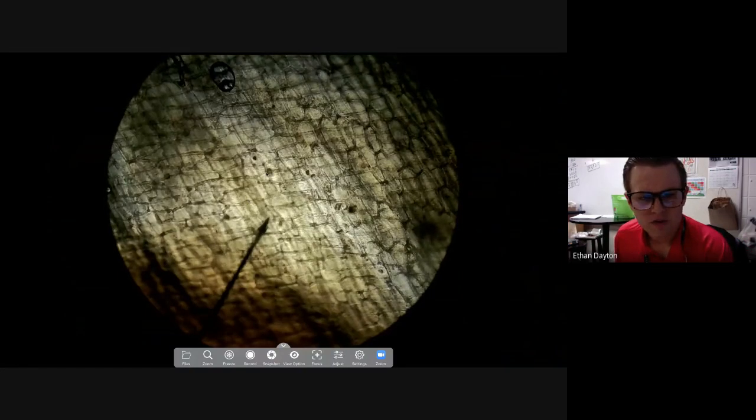It's difficult to see the nuclei of these. What you need to be doing is writing about the cell membrane, the cytoplasm. I know it's really difficult to see some of these nuclei. Some of them you can, but point to a spot and say, here's the nucleus of a cell, when you draw and label.